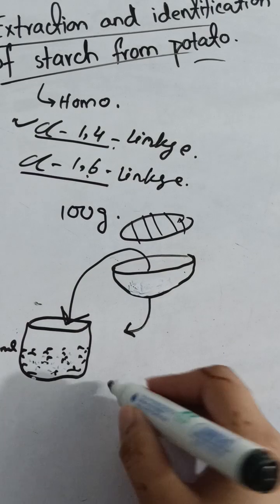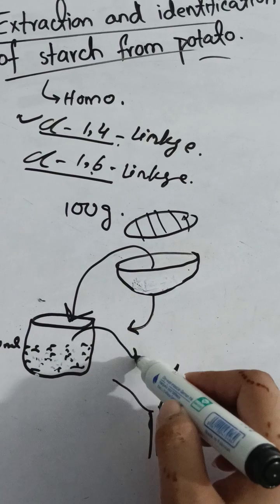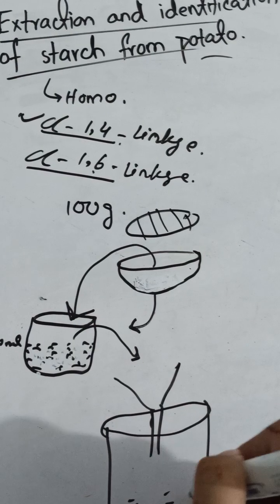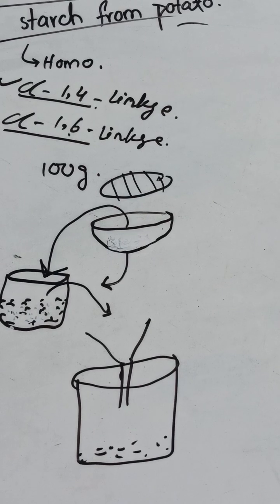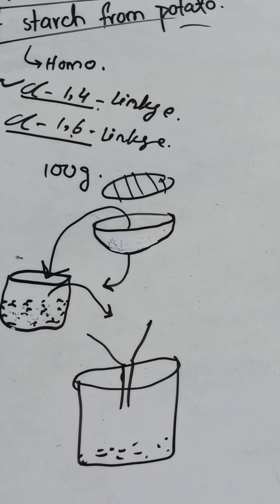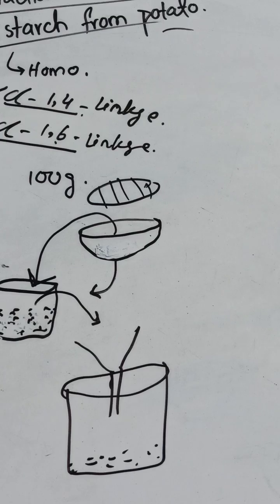You will use a filtration flask or something. You will put this into this and filter it right into another beaker, and you will get the residue after the filtration, just like that. You can use the filtration flask for it, and if a filtration flask is not available, you can use muslin cloth, because it is easy to observe and it makes the filtration fast as well.